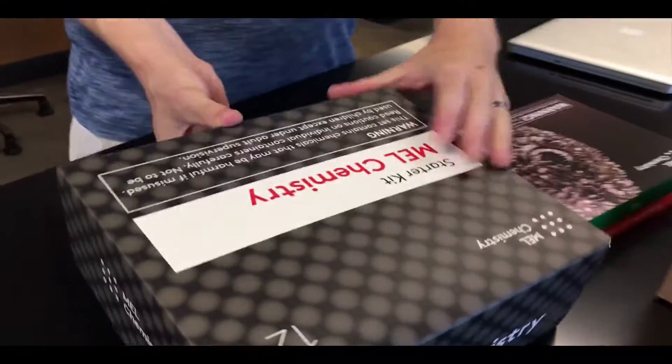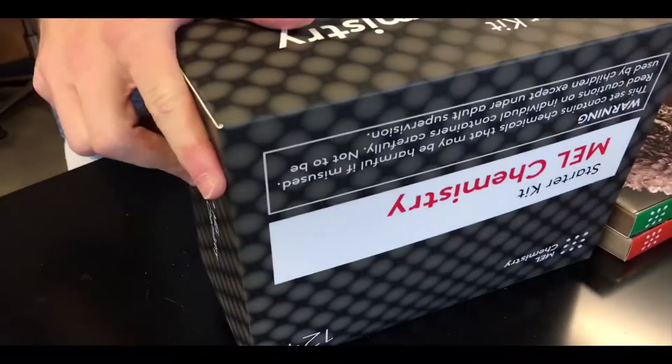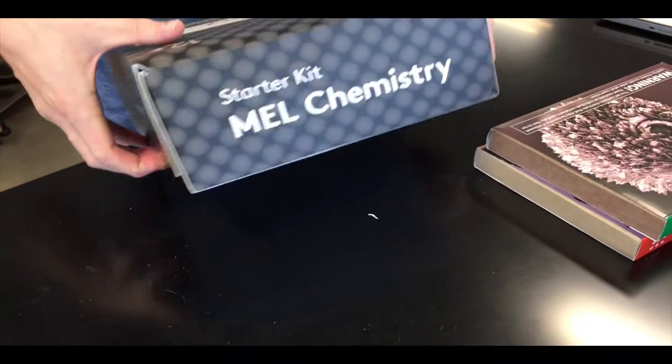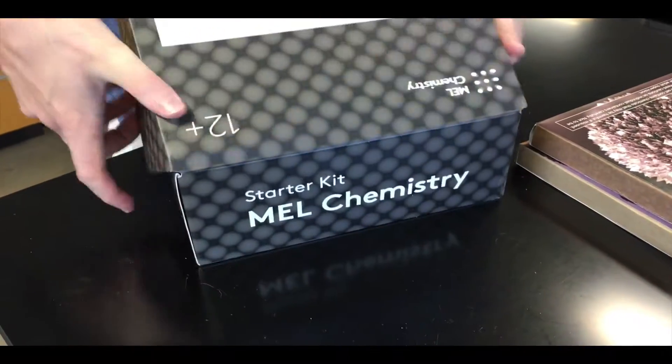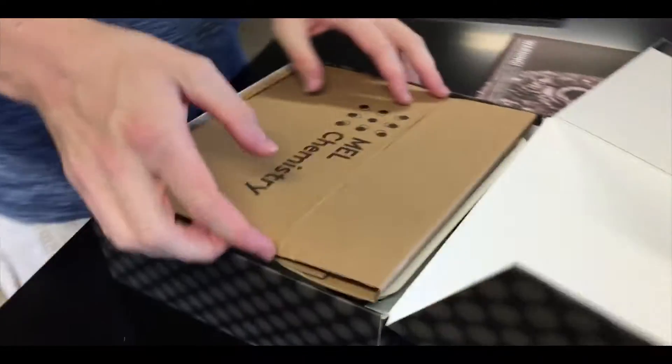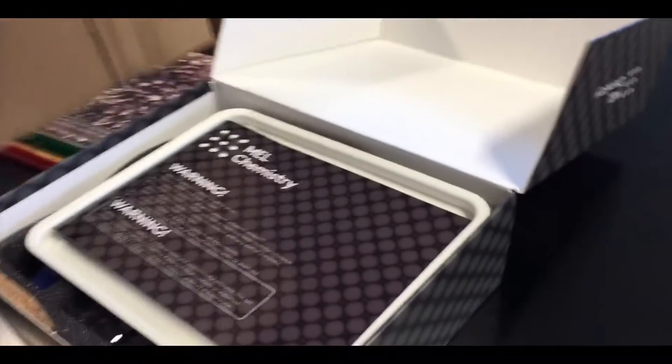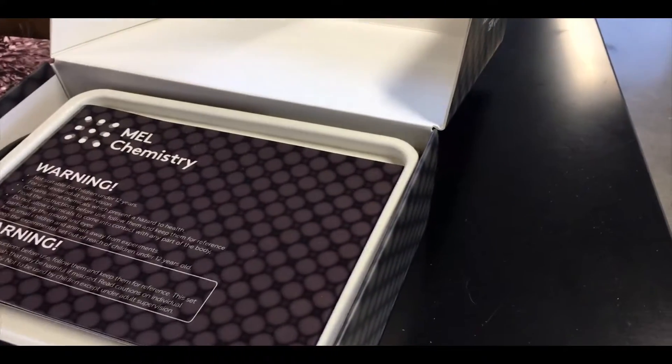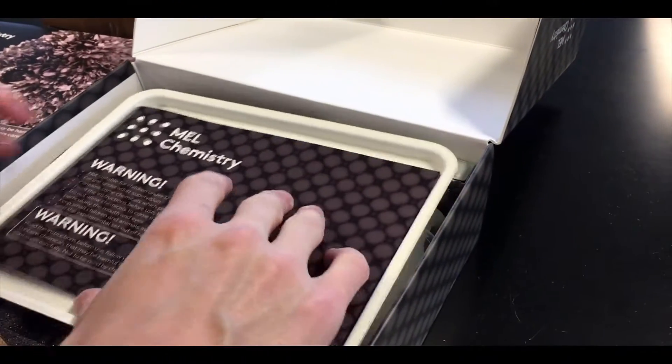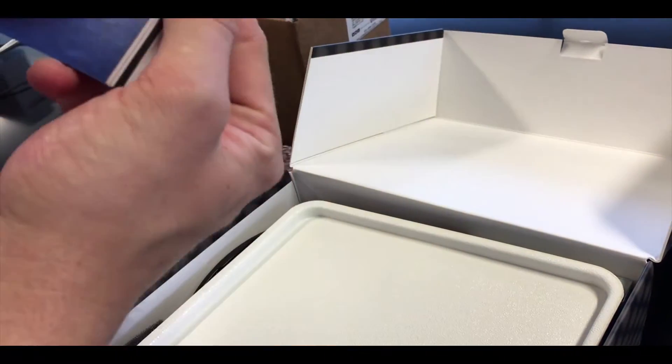All right, the Mel chemistry starter kit. There's how it works on the bottom, check that out in a second. Okay, we've got some cardboard. Great. Welcome to the exciting world of chemistry. Look at that.